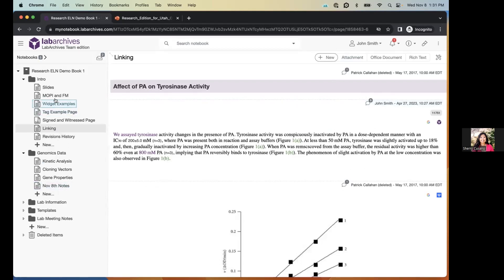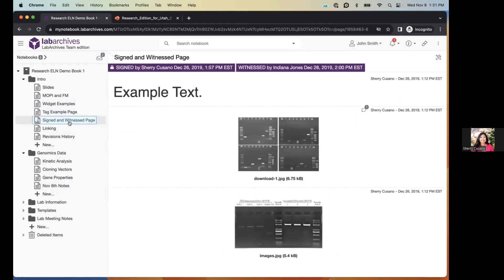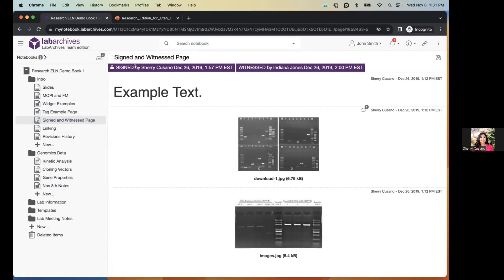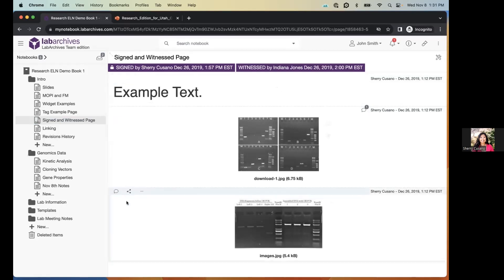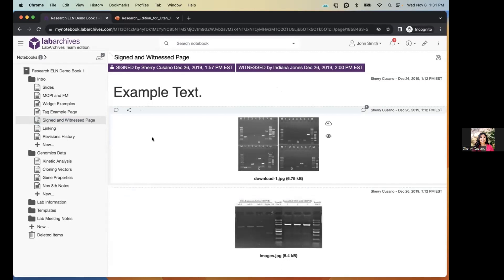Lab Archives has a page signing feature. Once a page is signed, it's frozen — no data on that page can be added or edited. This may be useful to protect intellectual property or to fit your workflow. On a signed page, you'll see who signed it and the exact date and time. There's also an option to select a witness. When you hover over entries on a signed page, there's no pencil or arrows icon — you can't edit it.